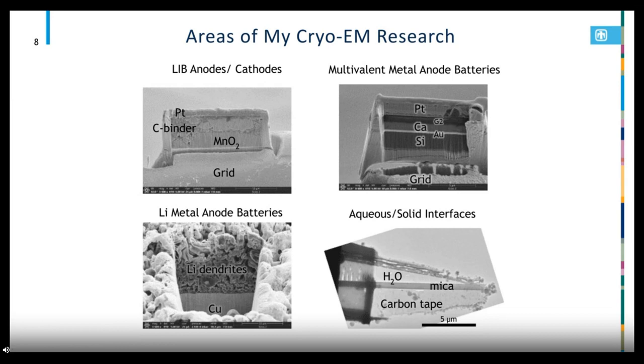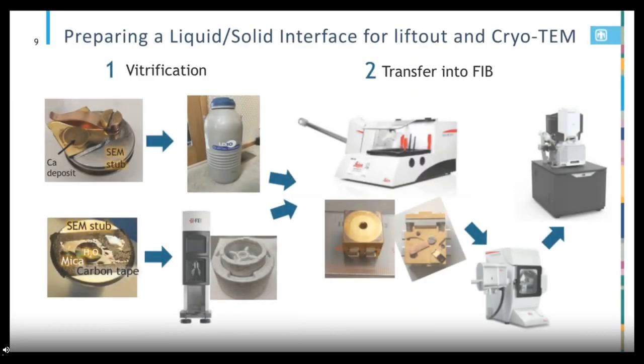So how do we prepare these interfaces? It's a complicated process, and I broke it down into 10 steps here. And it can be broken down in various different ways. But the first step is vitrification of your liquid-solid interface.